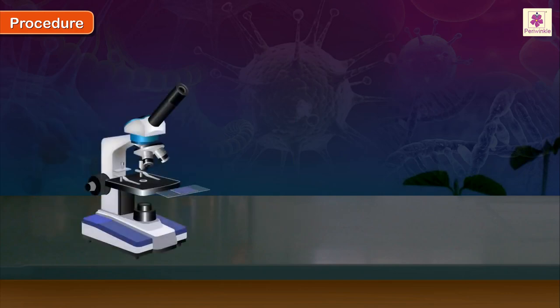Examine the inner cheek scrapings under the low power of the compound microscope.